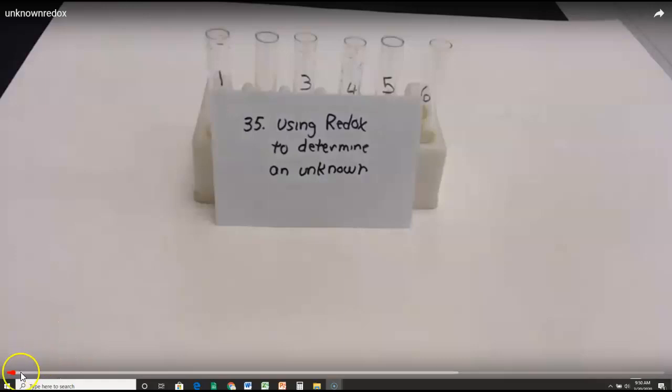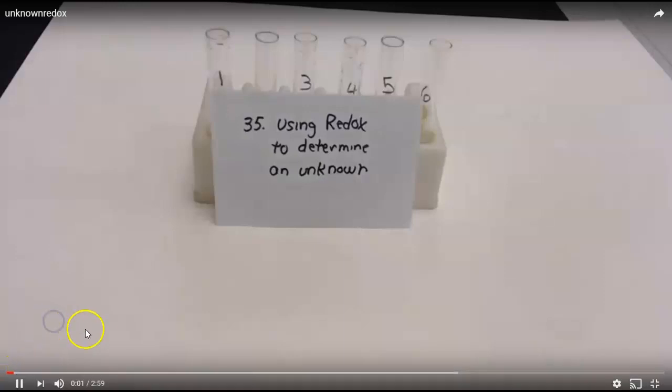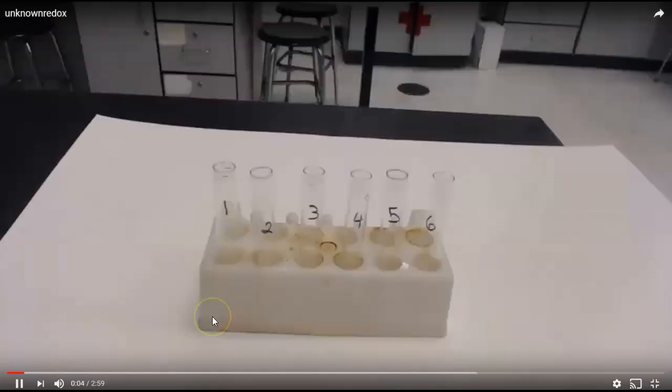So, let's take a look at the lab itself. So, here we go. We're doing lab number 35 using redox to determine an unknown. So, what you see we've got here is one, two, three, four, five, six test tubes all day. And eventually, I will start the lab. There we go. Now we're starting the lab.